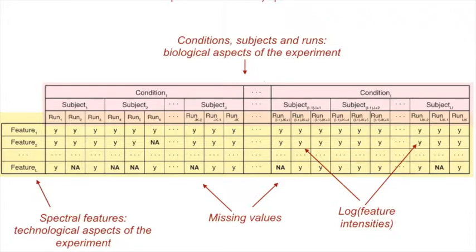Now, within each condition, I will have multiple biological replicates, and each biological replicate can be represented by multiple runs, either because they are technical mass spectrometry runs, or because there were multiple sample processing enrichment steps, which resulted in different mass spectrometry runs after that. The important things are that each protein has many features, which may or may not behave in the same way, right? We quantify every peak on the log scale, and we talked about this last week, because statistically it's much easier for us to work with differences, and the difference of logs is the log of the ratio, right? So we work with the log ratios, but we can do a lot more if we work with differences. And of course, the important thing is the missing values, which will be a really big part of what we have to deal with.